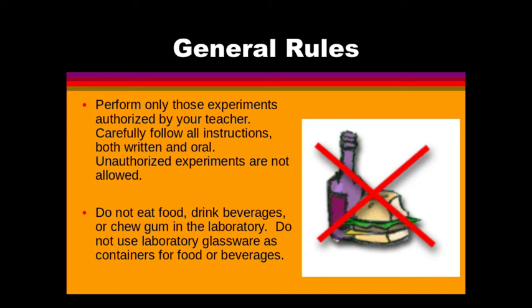Do not eat food, drink beverages, or chew gum in the lab. Do not use laboratory glassware as containers for food or beverage. There will be some labs, especially when you get into high school and college, where you can't chew gum. You shouldn't bring food and drink into a science lab, period.